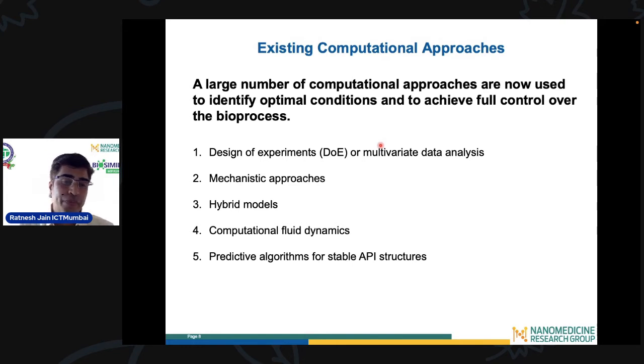Which are used in industry. CFD, or computational fluid dynamics, is used whenever a flow pattern has to be decided, whenever you are developing a reactor and assessing mixing dynamics, and how a fluid is typically mixed along with its components. And maybe if you are also designing how a cell culture behaves in a shear environment or another environment, together with the bioreactor, impeller and other bioreactor mechanics, you are actually deciding these things much before you do an experiment, using CFD.